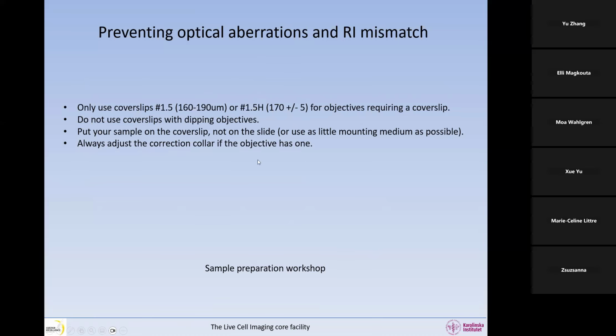And always adjust the correction collar if the objective has one, because otherwise you're introducing these optical aberrations yourself by using the wrong position of the correction collar.